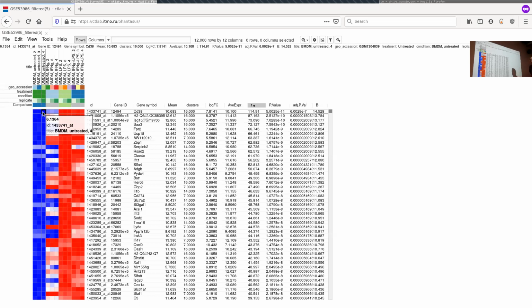So the adjusted p-value here is, and who knows what methods for multiple hypothesis correction there are? Bonferroni, good. Is there any other method? Yeah, there are many of them. Benjamini-Hochberg, yeah, is also a good answer.